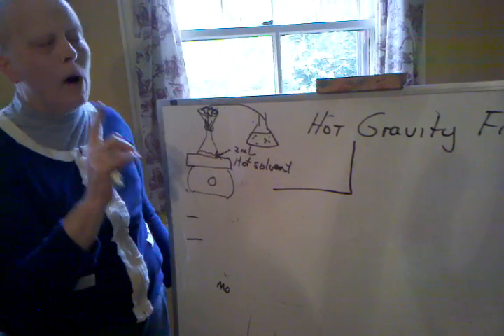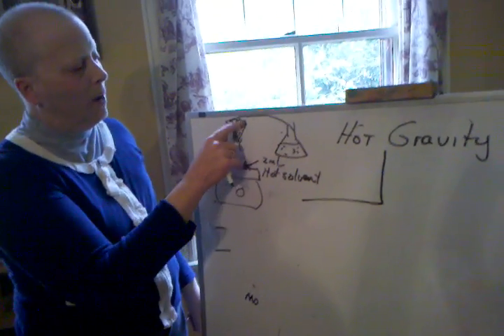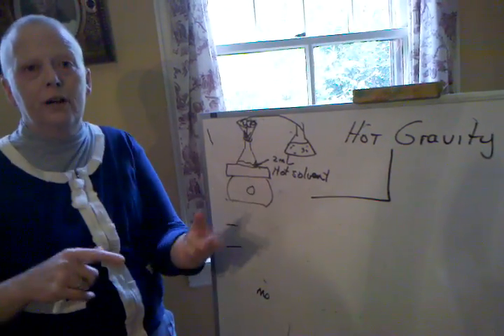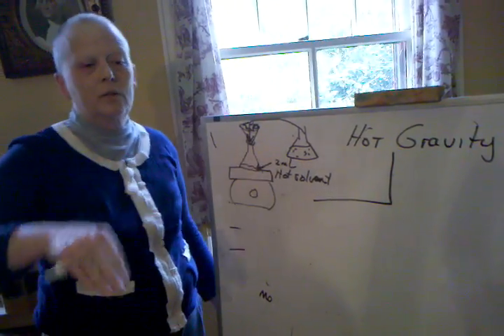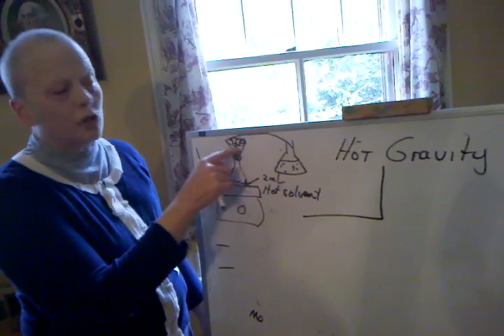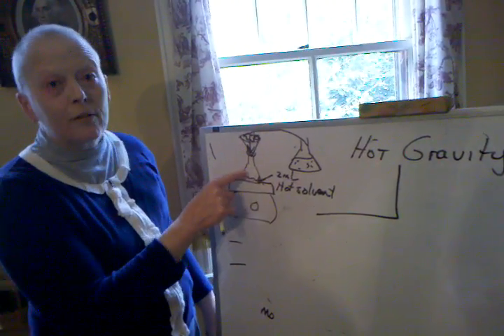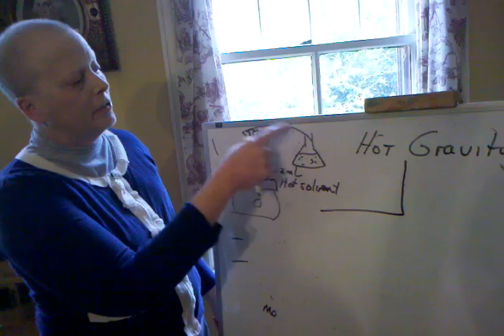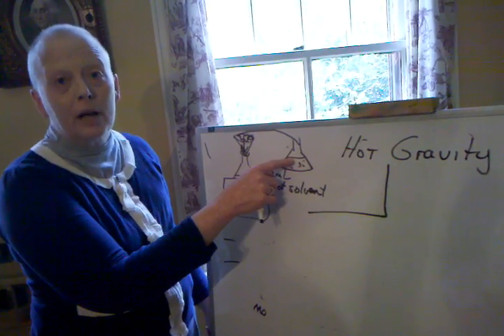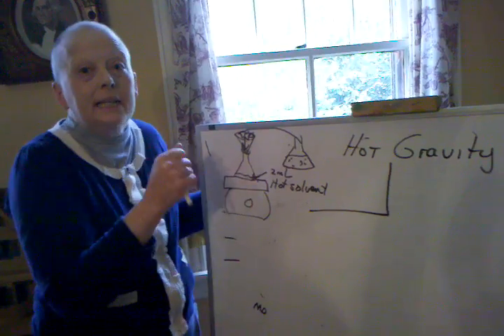Now you might think, why do you have to filter it through quickly? Why do you need this fluting? A fluted piece of filter paper is sort of like a coffee filter. You know how a coffee filter has those folds in it. You want to have a huge surface area because you want this to go through very rapidly. You want it to go through rapidly because you're worried about your desired compound coming out of solution, because it's sitting in the hot solution, right?